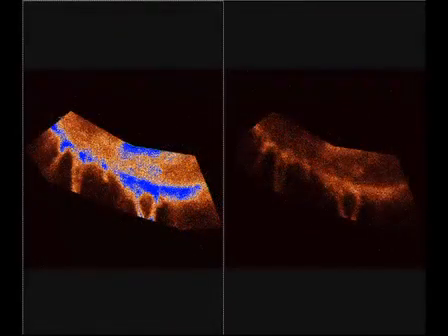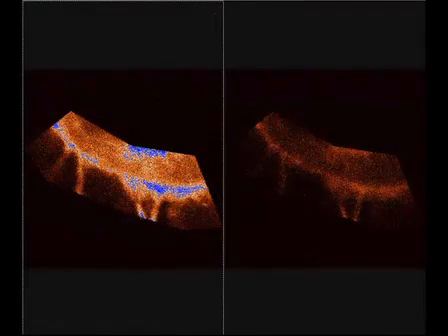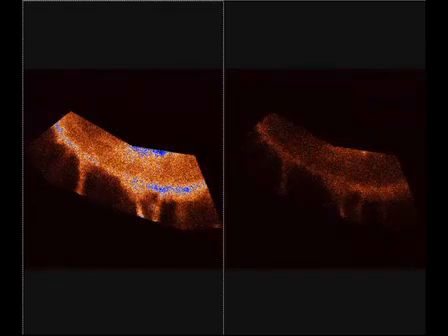During photo bleaching, monitor the cellular movement and reject measurements obtained with appreciable movement in the XY plane, as these measurements can report false FRET efficiencies.